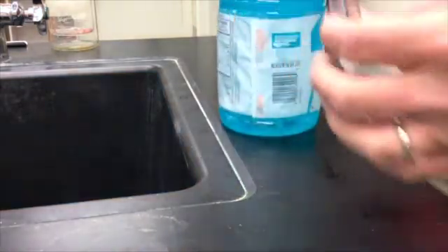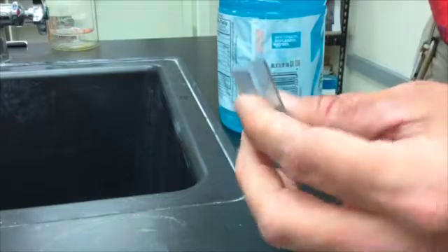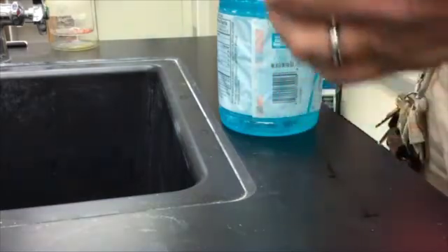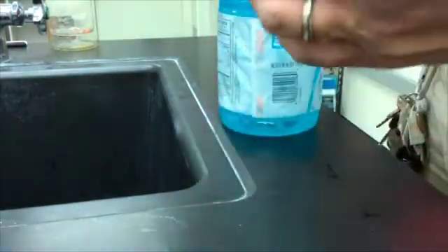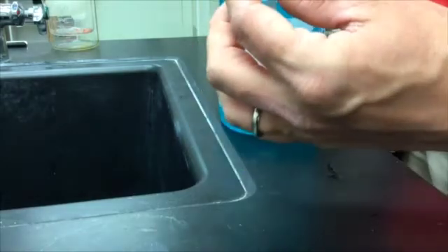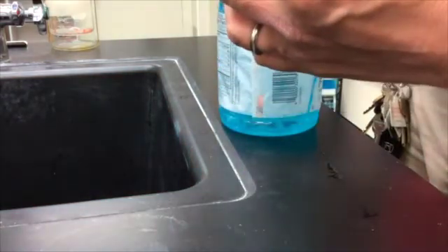So what I am going to do is fill this with some of our Gatorade solution, and then I'm going to dump it out. And that's going to get rid of anything that was in there before. So I'm going to fill it with the Gatorade solution, and dump it out. And then one more time, I'm going to fill it with the Gatorade solution one last time.